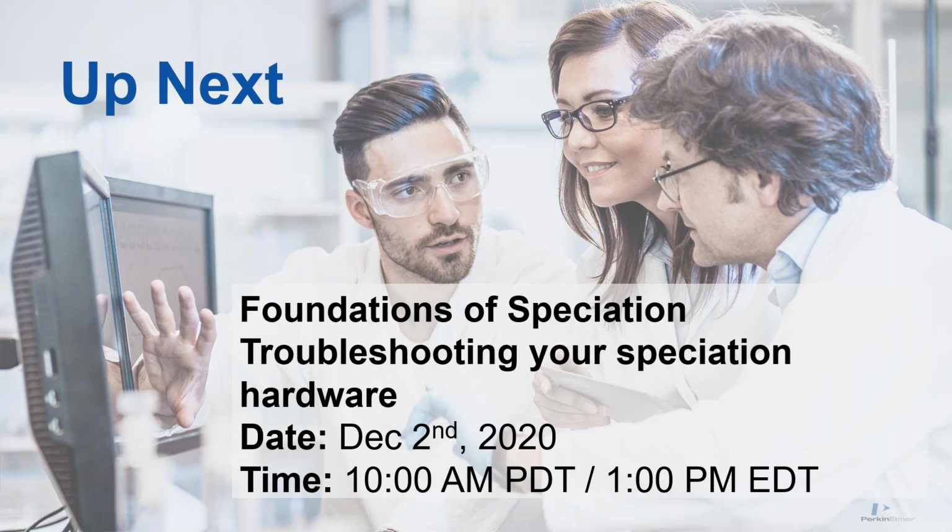Another follow-up question from someone: can you use MSF and IEC together in a single method? I think Brady answered that. Yep, you can. You just want to figure out which correction works for that particular wavelength in that particular matrix.